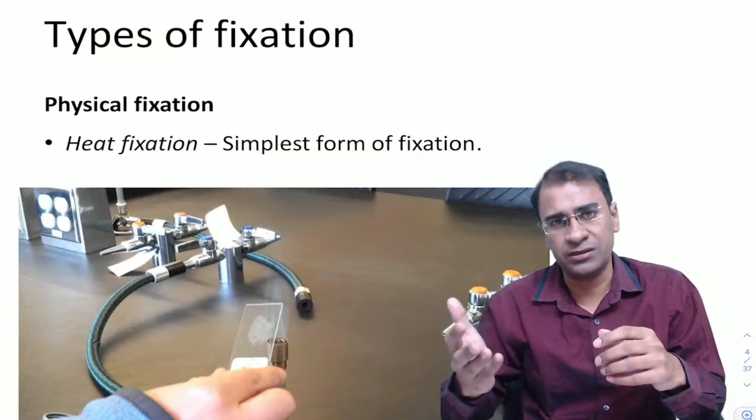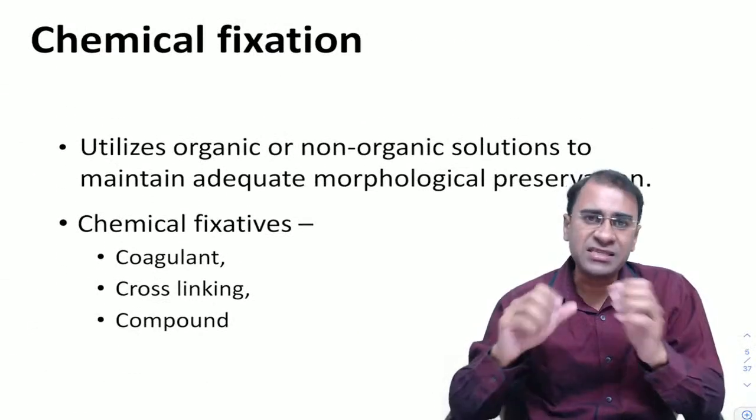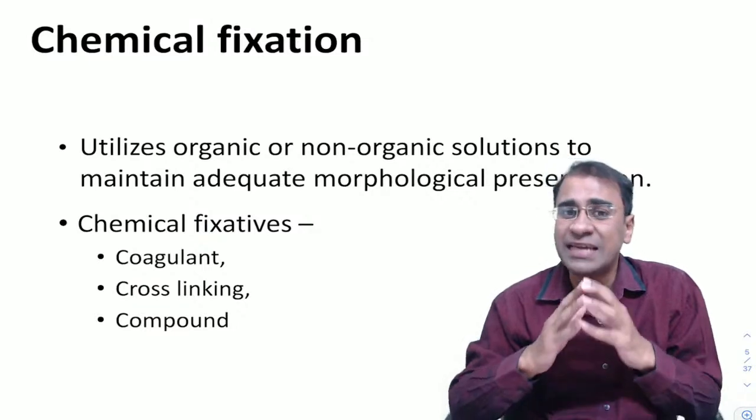We rely on some other methods. And what are those? Let's move forward. The basic fixation method here is actually something called chemical fixation.